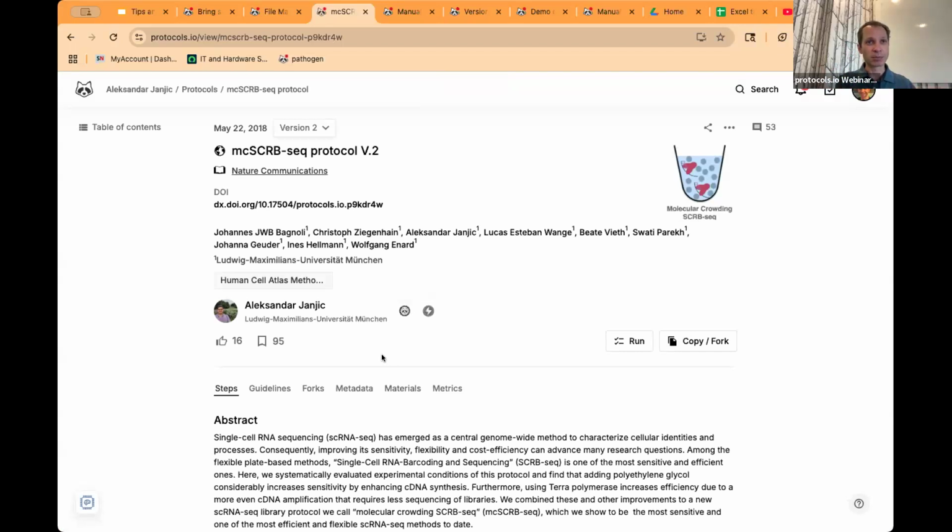A collection is a snapshot once you've published it, and we have a DOI for it. We're not allowed to change things inside the contents of anything that has a DOI. So you would need to create a new collection.